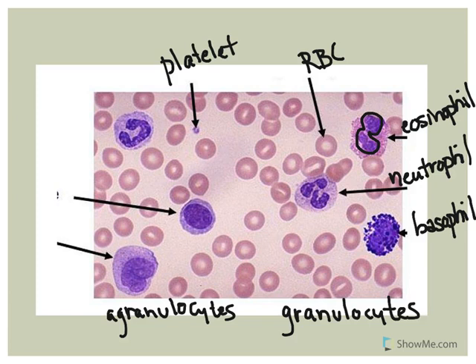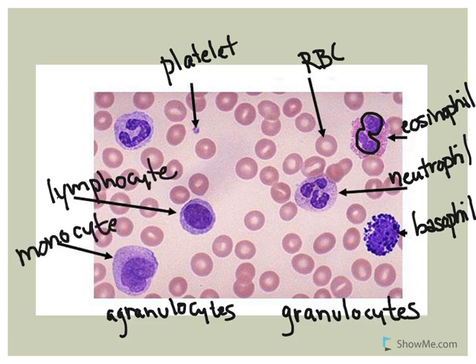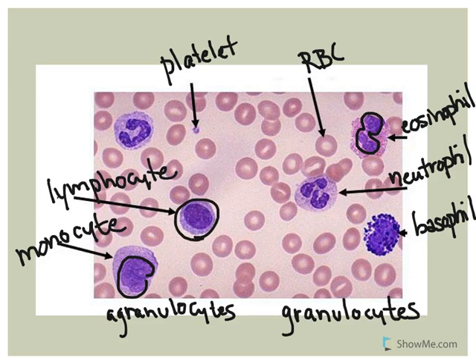The agranulocytes include the lymphocytes and the monocytes. Monocytes are very large agranular leukocytes with variable-shaped nuclei — this one looks kind of kidney-shaped. The lymphocytes are agranular but pretty small, almost the size of a red blood cell. Their nuclei are sometimes so large that all you really see is a very thin rim of cytoplasm around them.